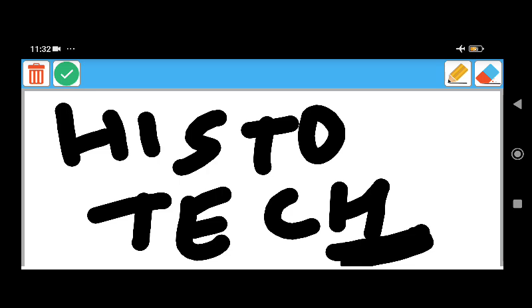Microtomes are precision instruments designed for cutting thin sections of tissue, thin enough to enable examination under a microscope. Once sections are cut, they are floated on a warm water bath to remove folds. There are various types of microtomes, namely rocking microtome, rotary microtome, base sledge microtome, sliding microtome, and freezing microtome. Then knives.